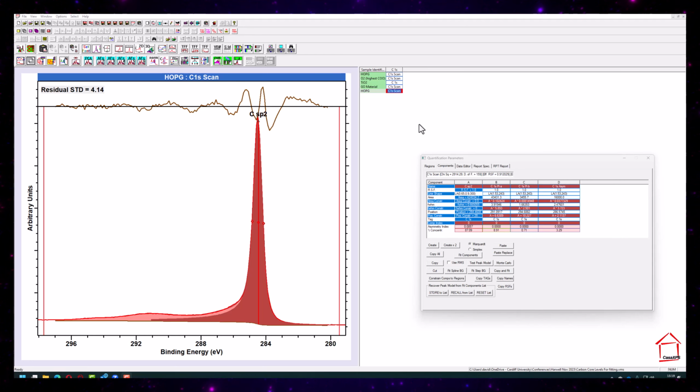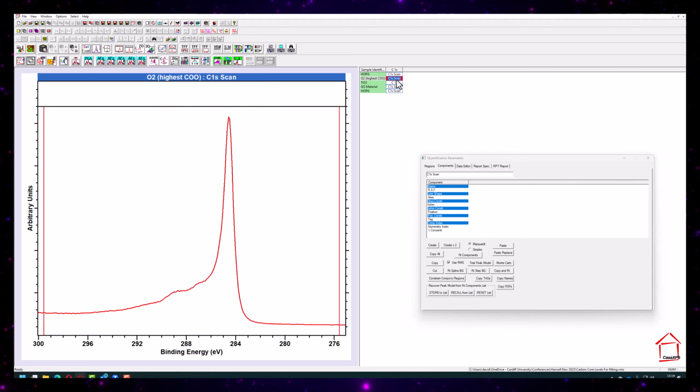Then move on to taking a model such as this and applying it to this oxidized carbon sample, remembering the sort of parameters, the sort of regions where you would find a CO or COH bond, a carboxylate or carbonyl type function in relation to a peak at 284.5 electron volts, based on the slides in the overview.